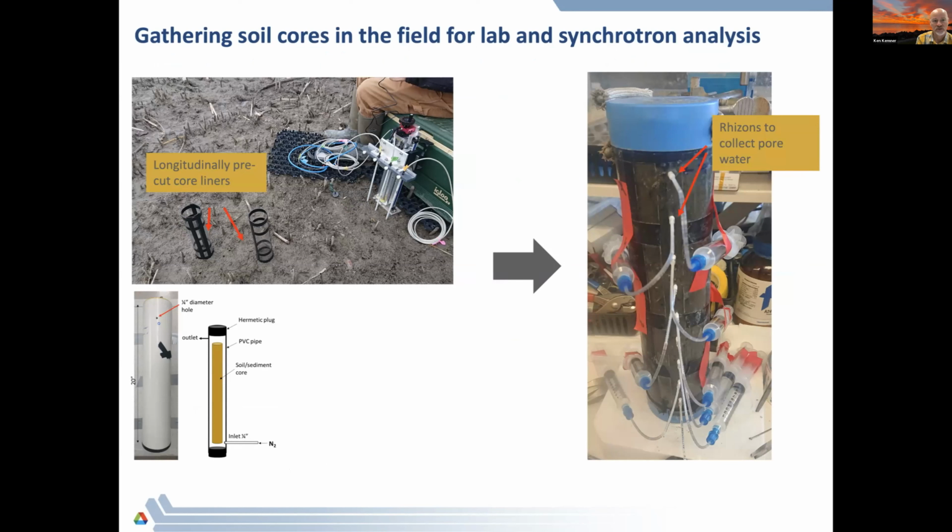And so one of the things we've been doing recently is actually going to the wetlands, and we developed the approach where we take a 3-inch or a 1-inch soil core. You can see there in the top left image. That soil core is capped, put inside of a PVC pipe with plugs on it that are flushed with nitrogen, and the soil core in that thin plastic is kept anoxic while it is driven back to the laboratory. If it's more than a 12-hour drive, we actually have coolers to keep these at a reduced temperature. So besides reducing the oxygen diffusion, we're also reducing the microbial activity rates to keep it stable at the way it was when it was collected in the field.